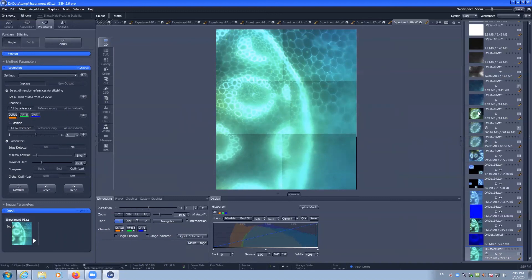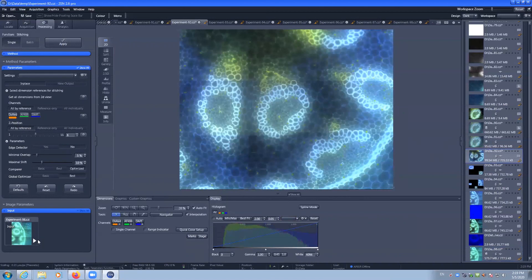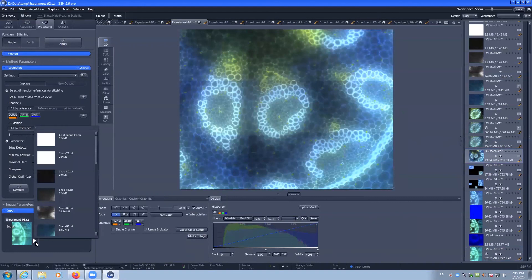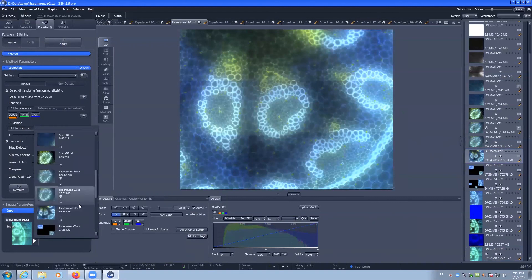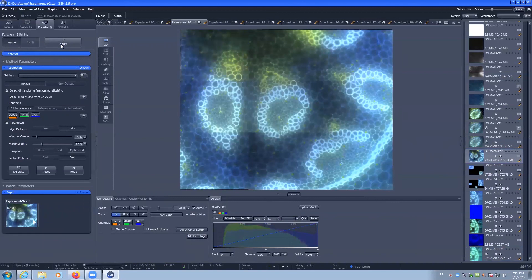We go back to one of our 2D tiles. You can see that alignment happens a lot faster than if it's a Z stack image.